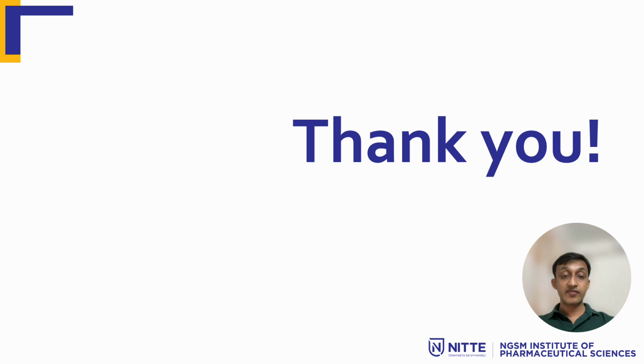To summarize, we have discussed two important distillation techniques: steam distillation, which is based on immiscible liquids, vapor pressure addition, and reduced boiling temperature, and molecular distillation, which is based on mean free path, high vacuum conditions, and direct molecular transport. While steam distillation is widely used for essential oils and natural products, molecular distillation is essentially used for high purity, thermally sensitive, and high molecular weight compounds.